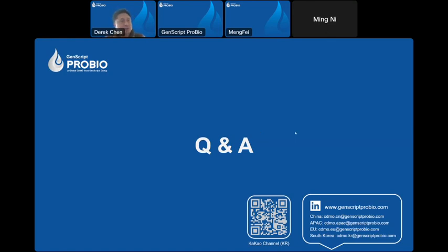Yes, so basically IgG contains 2 chains, the heavy chain and the light chain. So when you do the humanization, you need to consider both chains. While for VHH, it only contains 1 heavy chain. So the overall process is a little bit simplified.